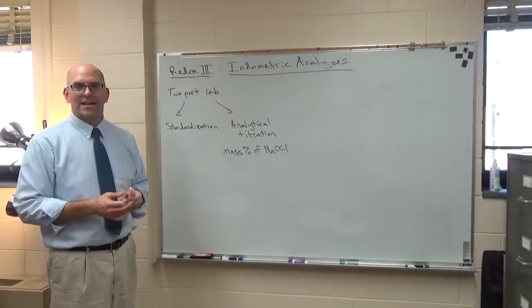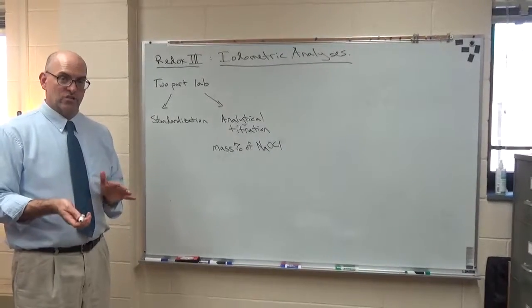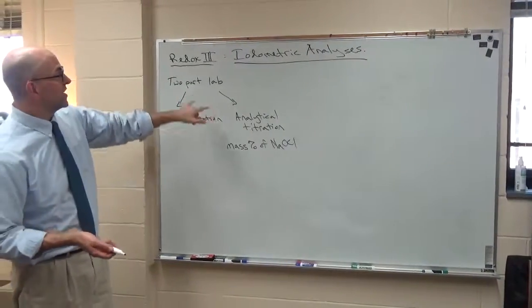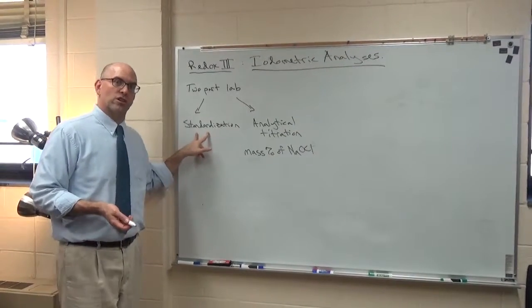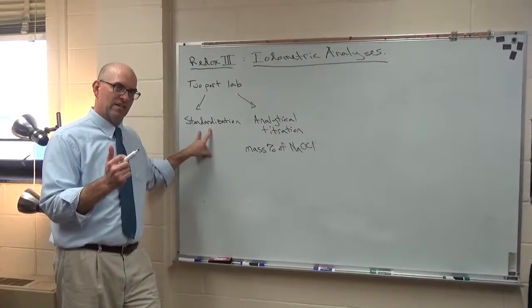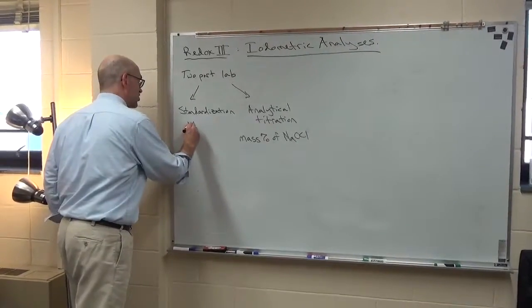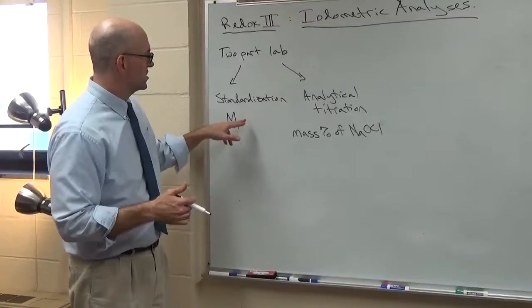Okay, we are right back at it on Redox number 3. Now, as I mentioned in the previous video, if you had a chance to watch it, what's coming up in a couple of weeks, or actually maybe next week, depending on when you're watching this video, is a 2-part lab, where in part 1, you're doing what's called a standardization, which means you are determining the molarity of a solution to a very precise degree. And you probably will have talked about molarity in lecture by now, but we'll do it in lab if we need to, which is the moles per liter.